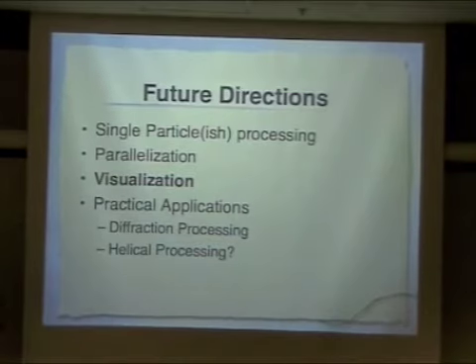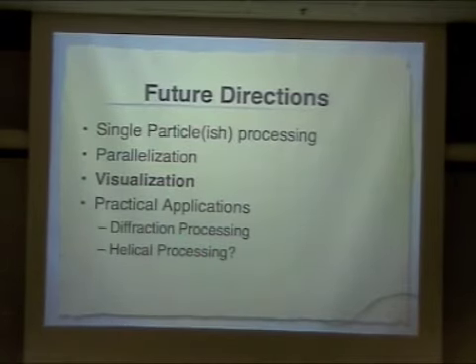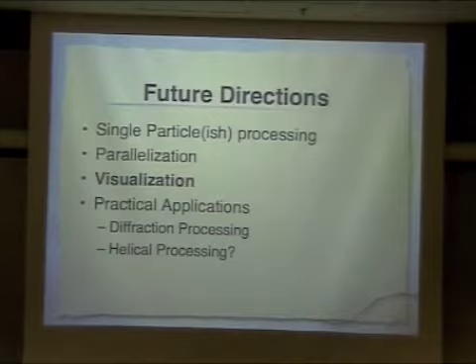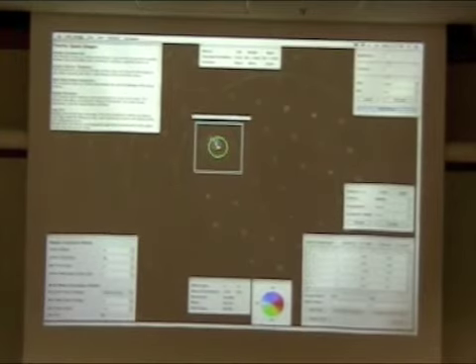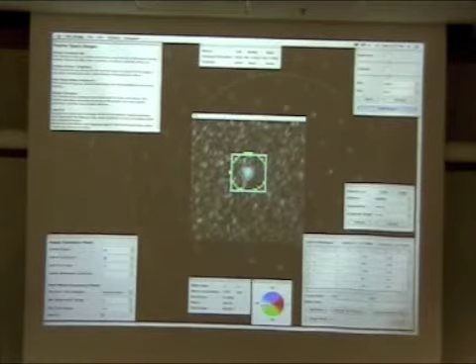Visualization is a big one for me. As I said, the view that you saw there, the block loader, I'd like that to be just the beginning as we go forward with certain developments in 2DX. There are a lot of tools out there that I think are really badly needed. One is a lattice line interaction, being able to look at how these lattice lines are fit, throw out outliers, that kind of thing. I think that getting a more visceral feel for what your lattice lines are looking like, if nothing else, would help guide your project. Being able to edit them would be a definite bonus, but maybe we can talk some more about those sorts of things. So there are just a few images of visualization.